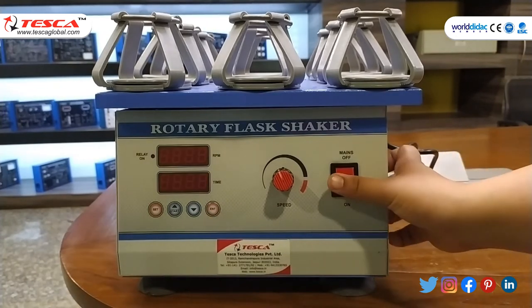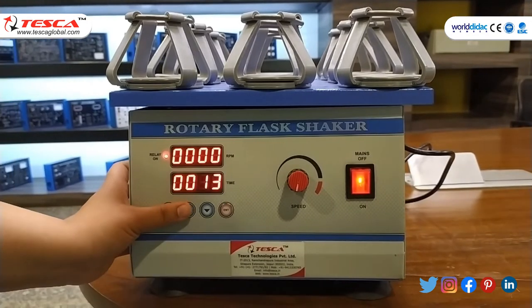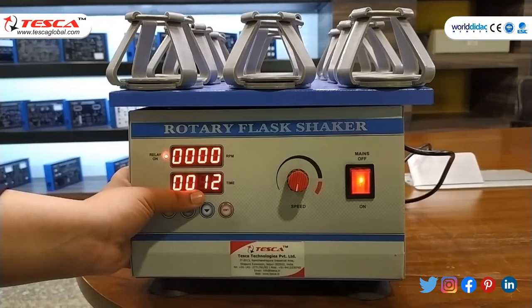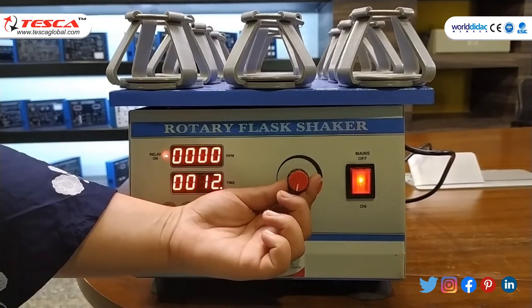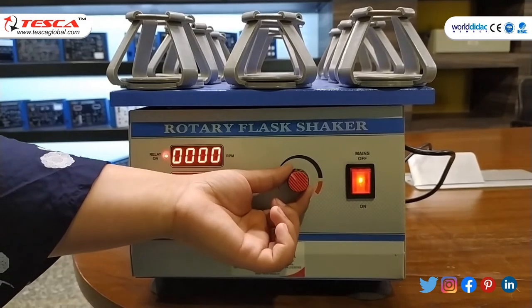Now we will switch on the power supply. After that we have to press the start button — as you can see, I have set the time to 12 minutes. After that we have to increase the speed using the speed control knob.